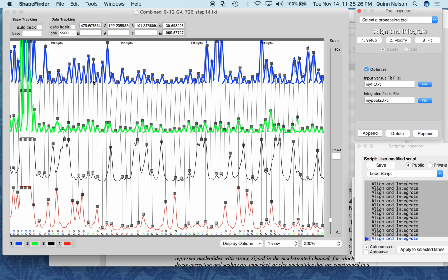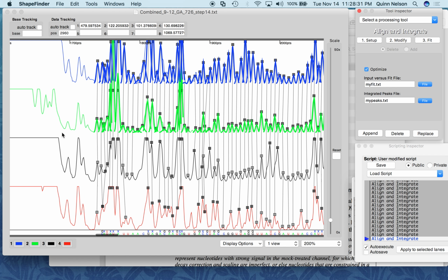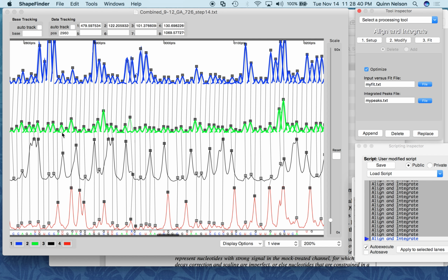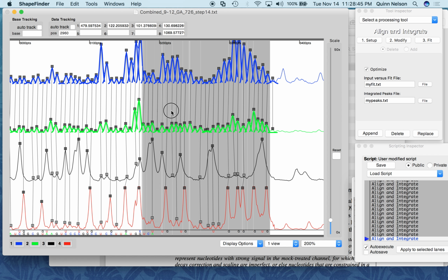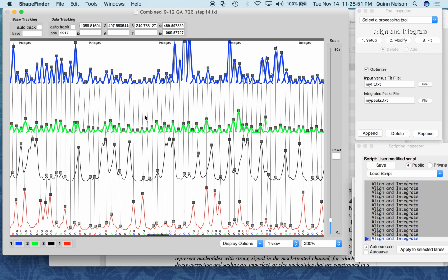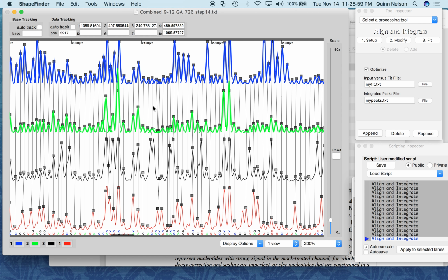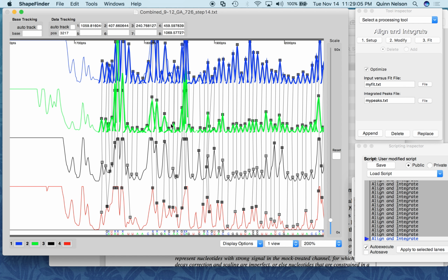So as you can see, it's finished. When you have blue and green lines highlighting it, it's finished. It's great. Make shape great again, if you will. So that is what it looks like. Fairly uniform. Look at this read. I will highlight the gloriousness of this, just scanning in between the blue and greens. This is uniform. It is consistent. It is vertical. They are basically parallel till here where I tried to clean it up. That is okay. I think this is going to be a good read, guys.